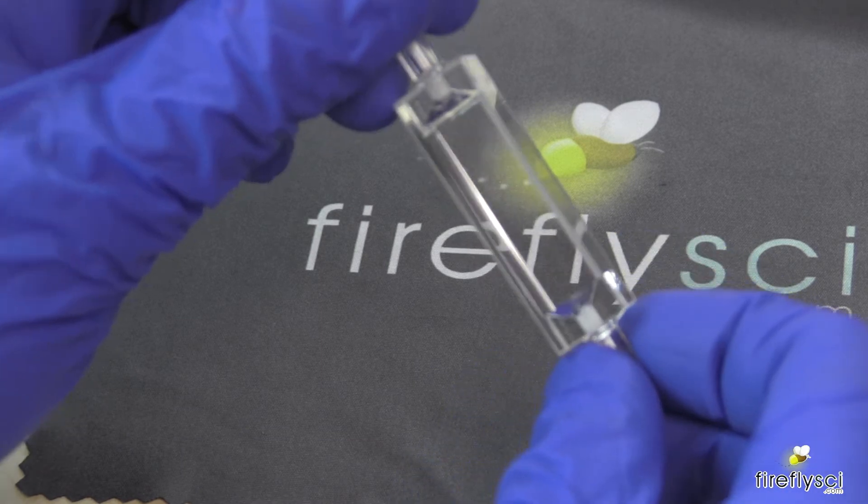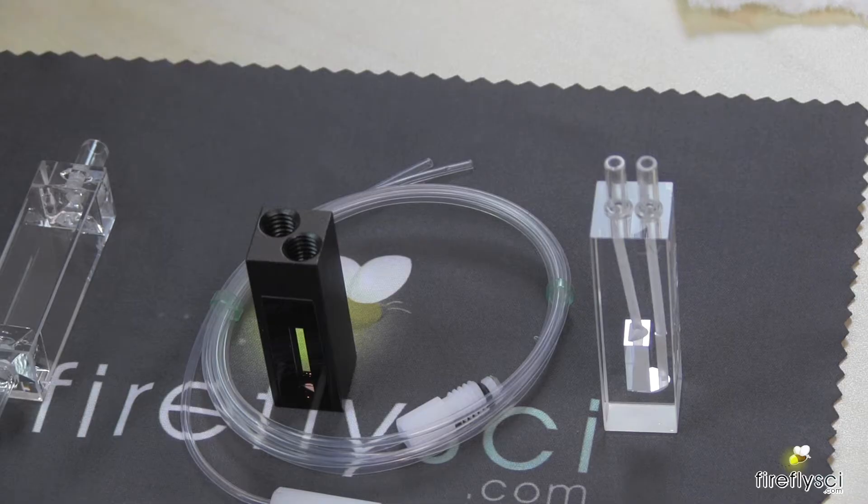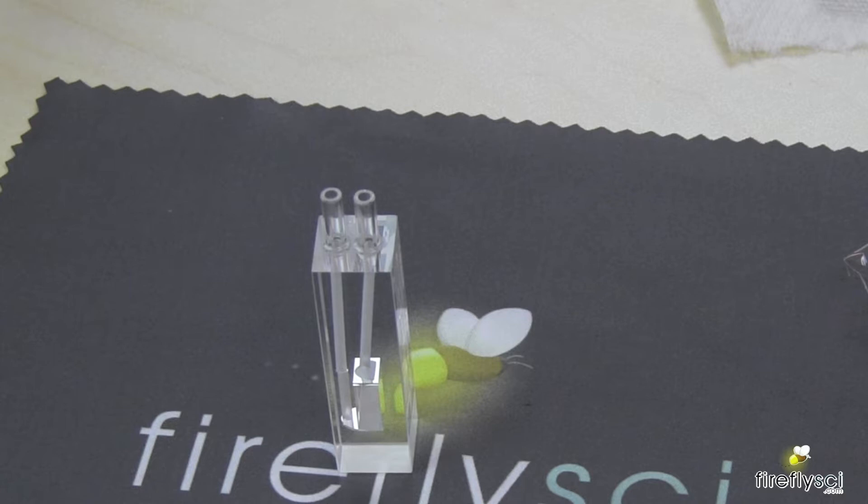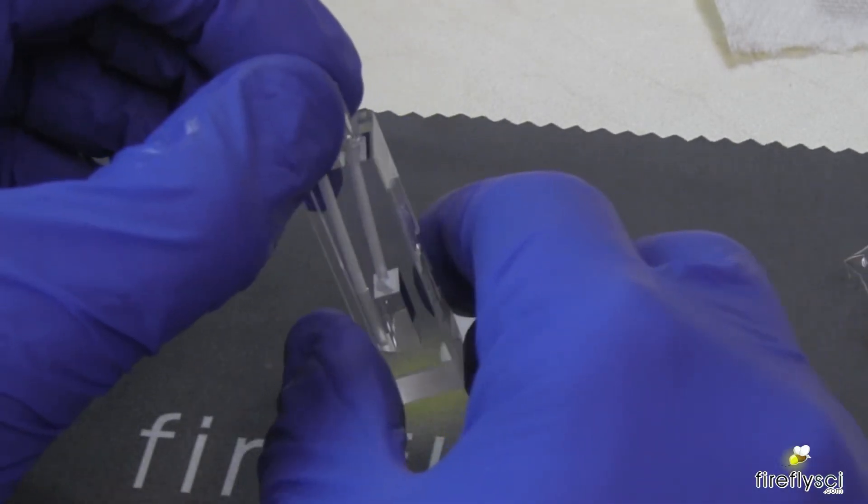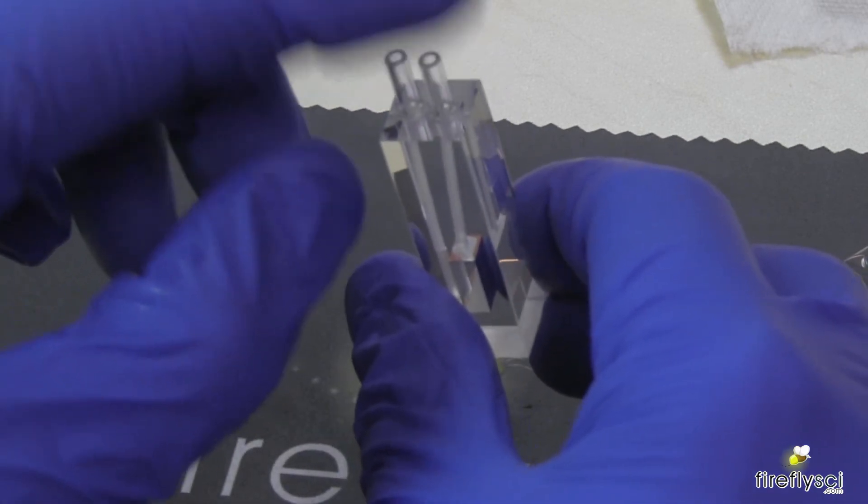This allows a steady flow of samples to be analyzed rather than removing the cuvette and having to refill it. The inlet and outlet tubes can be in different locations. Some cells have the inlet and outlet tube on the top of the cuvette, like we see right here.